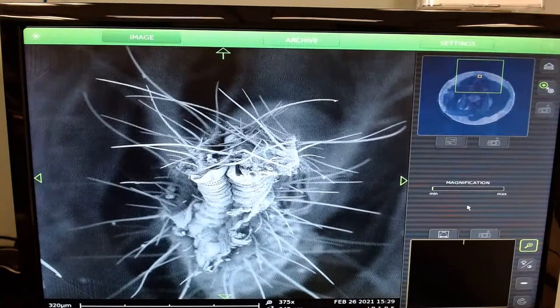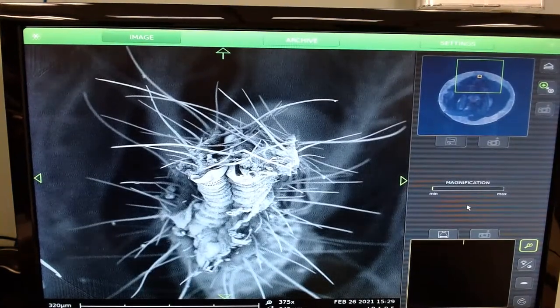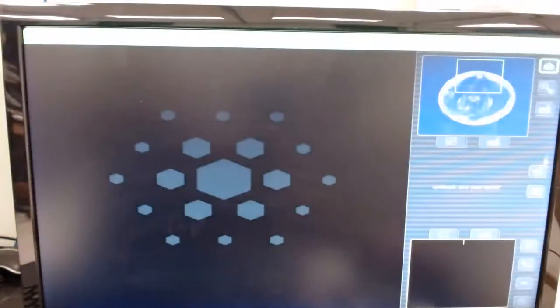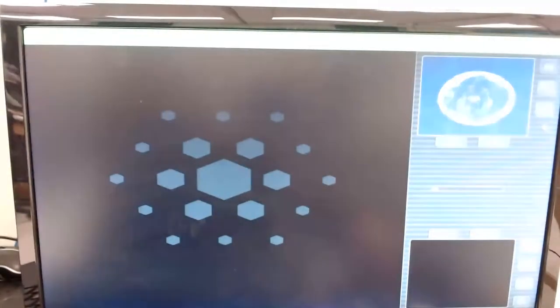Ooh. That's a fun one. Yeah. All right. Let's look at the spider. Do you want to do the leg or the whole spider? Why don't you start with the whole spider? Okay. You can't get a good image of the legs. You can see on the spider the legs kind of coming into the body, so I want to look at that.